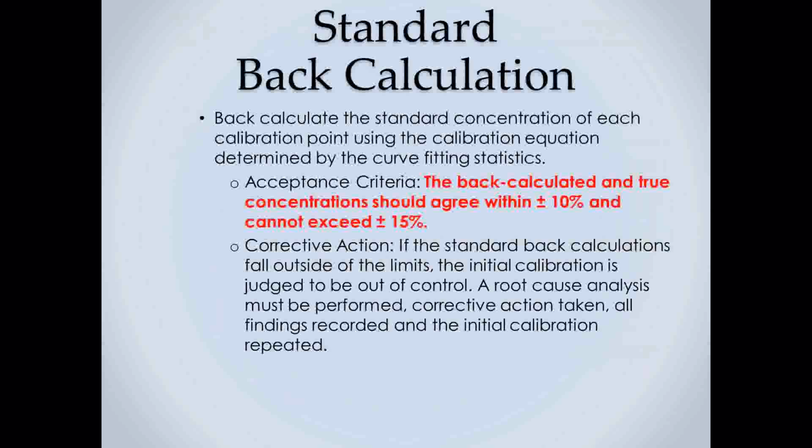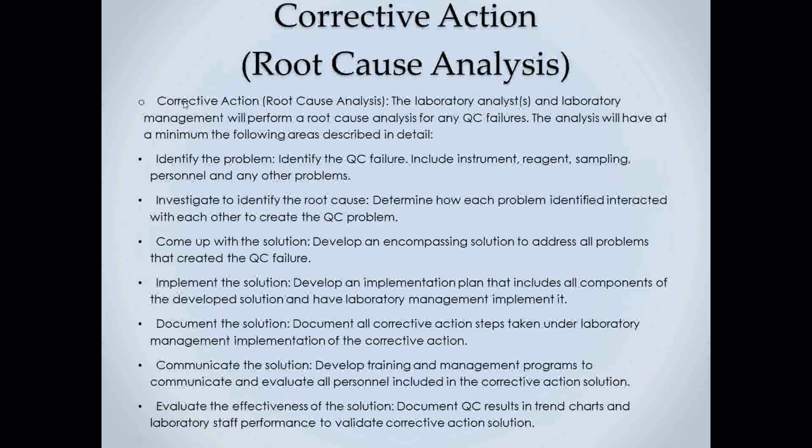Now we're getting down to the end here, the root cause analysis. So what are we going to do with that? Well, we just define it, and this comes from ISO language. It says corrective action, root cause analysis. A laboratory analyst and laboratory management will perform a root cause analysis for any QC failures. The analysis will have at a minimum the following areas described in detail. You identify the problem, investigate to identify root cause, come up with a solution.